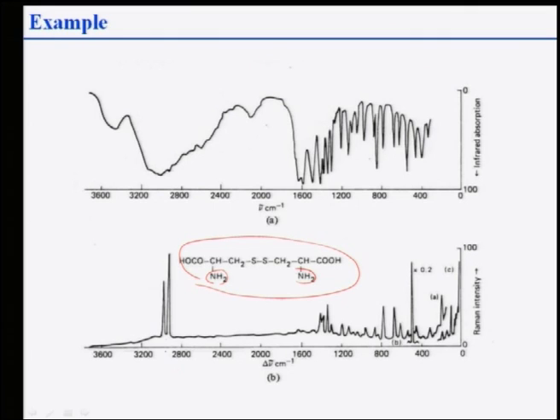You can see that Raman gives you very nice spectra as compared to IR, and Raman shifts come at a higher delta nu than nu. This is the Raman shift, the change in frequency, the change in wave number. This is nu, and this is continuous here. This is the fingerprint region in IR, but the most important things come in this higher change in wave number region.